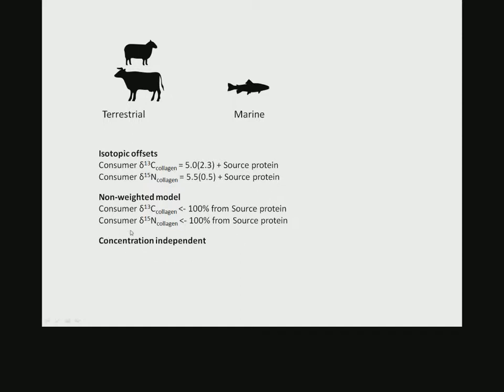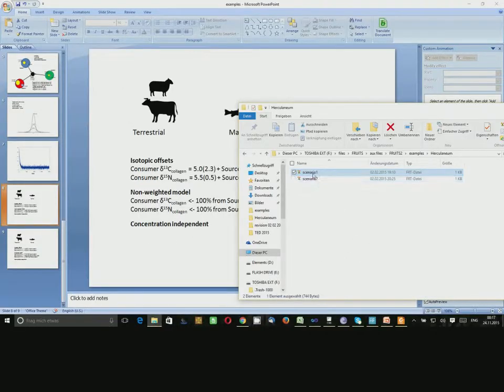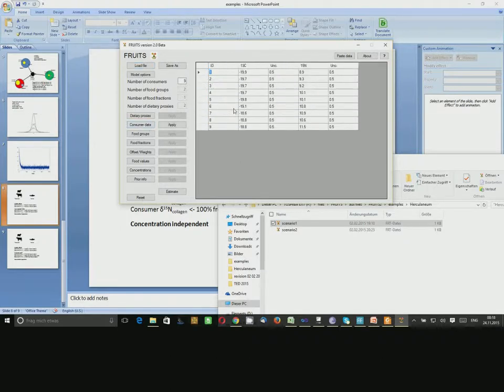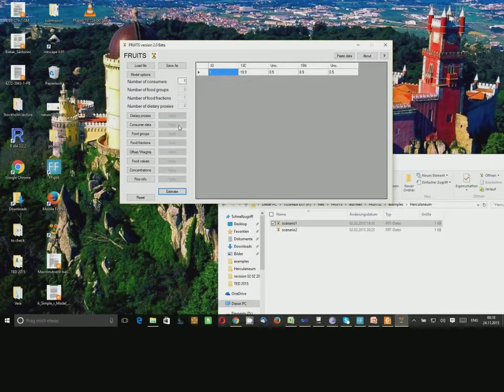Okay, so I have this model here already prepared, and actually in the publication, 9 different individuals were modeled, but here I'm going to show you the outcome just for one. So changing this to 1 and then pressing enter, apply. And just to go through the different model options and parameter values.